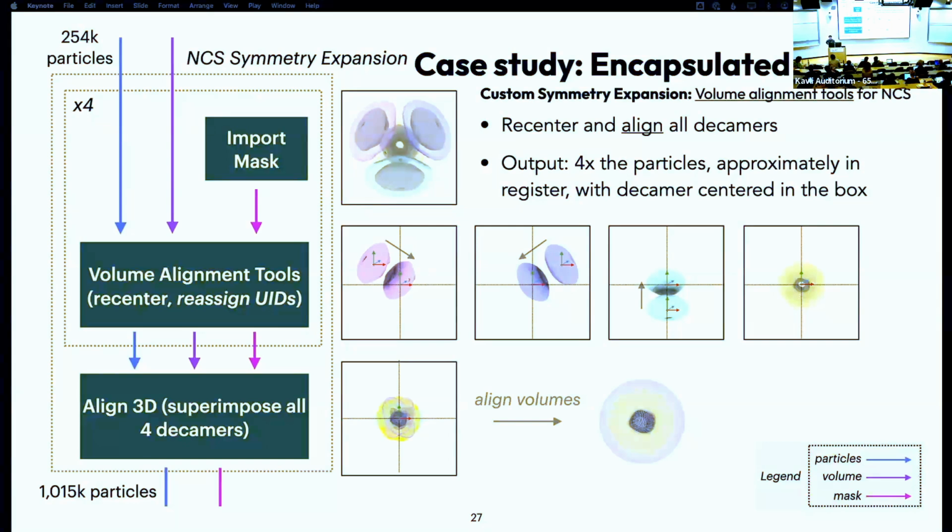And what I tried a lot with that was symmetry relaxation, because in that case, you're right, the axes were already coincident. I used volume alignment tools to align the symmetry axis with Z, because it was originally icosahedral and so in some random orientation. That did work reasonably well, but that data set was also hard for a lot of other reasons. But yeah, I think in that case symmetry relaxation is definitely useful, because you're specifically looking at, if it's 5 versus 6, you'd want to relax with 6-fold symmetry. Yeah.